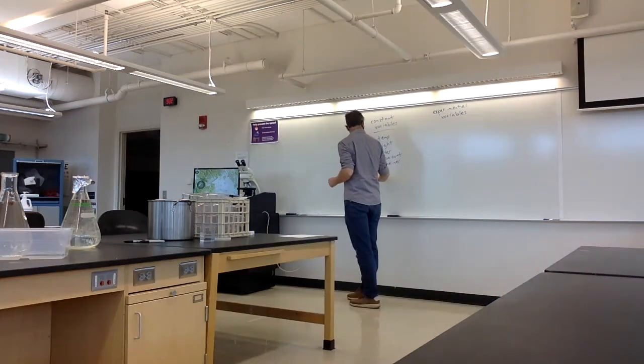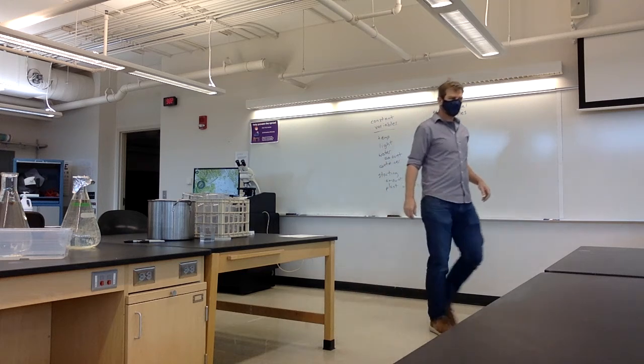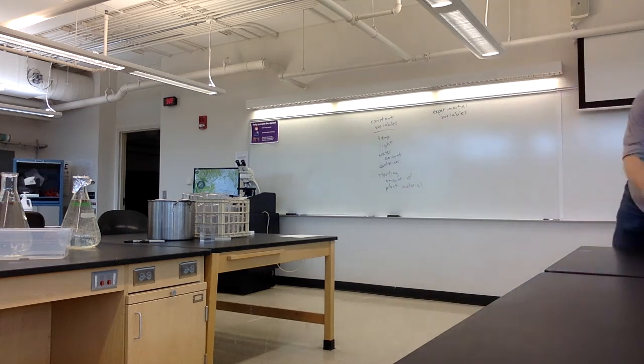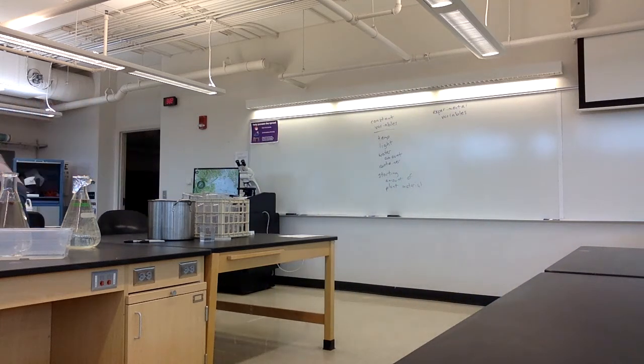And one of the things we want to standardize to begin with is the starting amount of the plant material. And that hadn't quite worked out yet. So these are basically our sorting containers.